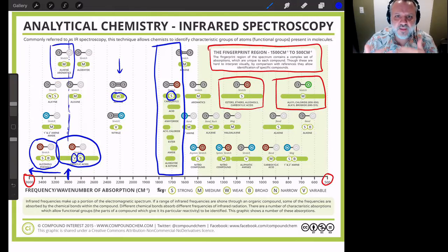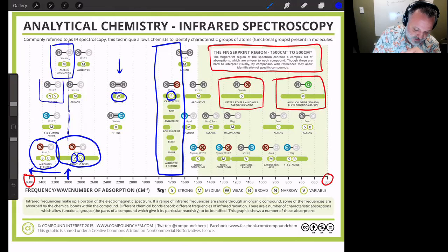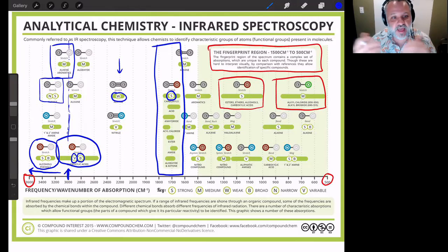And so what has a carbon attached to a double bond, for instance, aromatics, right? If there's an aromatic hydrogen, it'll appear on this side of the line. Again, if you have an alkyne, it'd have to be terminal, right? A terminal alkyne is the only type of alkyne that has a hydrogen attached to a carbon that has a triple bond. In that case, you would get a nice narrow band and a strong signal right there in the 3,200 to 3,300 range. It would be obvious.